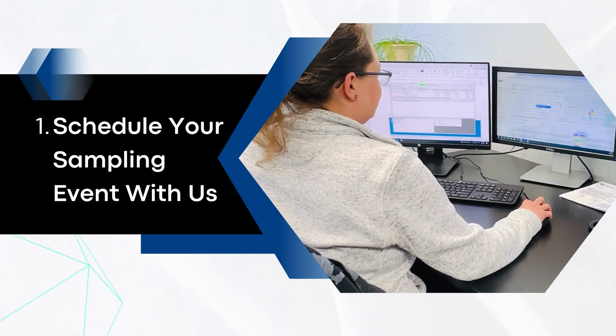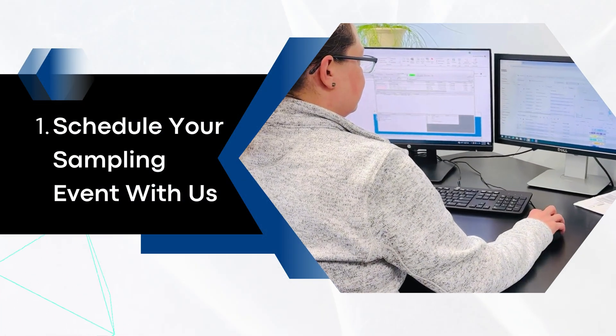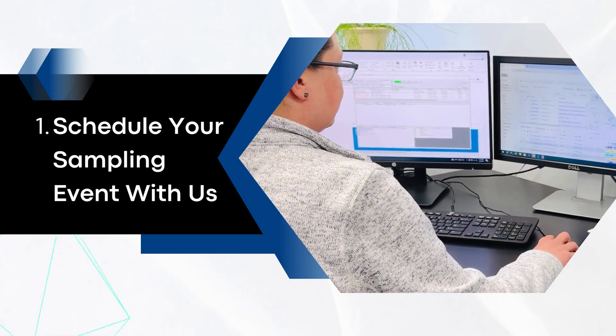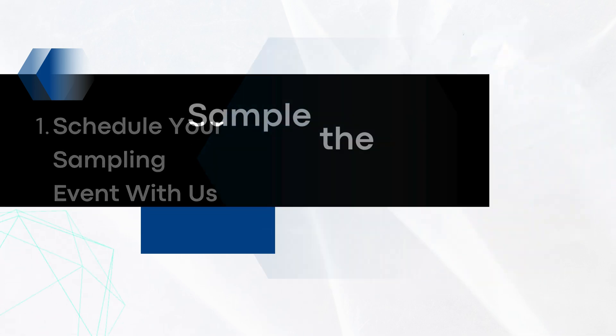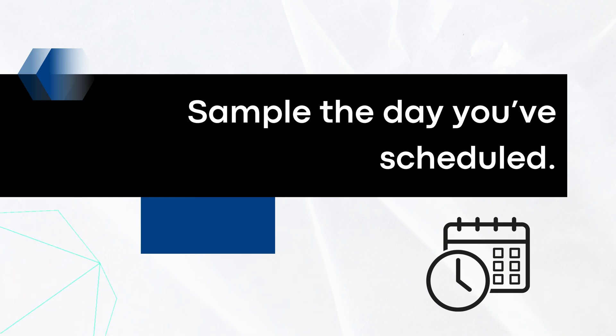First, schedule your sampling event with your Suburban Testing Labs project manager. Ensure you have enough time to receive supplies and know when your sample pickup or shipping date is. Sample on that day.